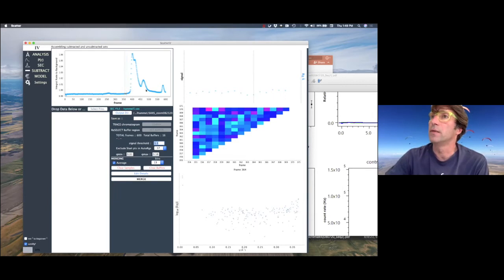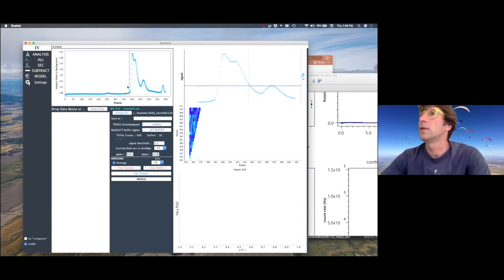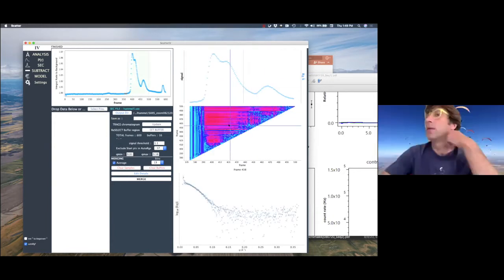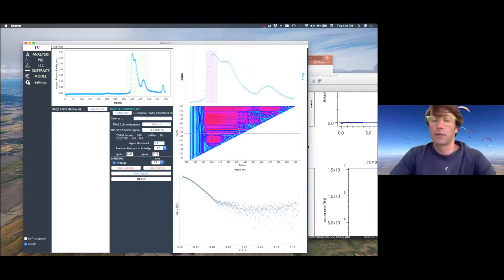Now you can look at that and zoom in on the peaks. I'm showing this very difficult problem. Okay, so these are our peaks, and Rob mentioned using this similarity map to select the region where the most cyan color is the very similar region. We got some similarity here, and I can call it, let's say, Hammel 35P1. That's how I call those samples for you. You can click the merge here.